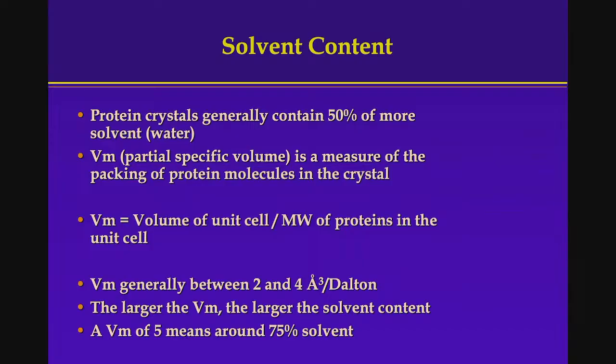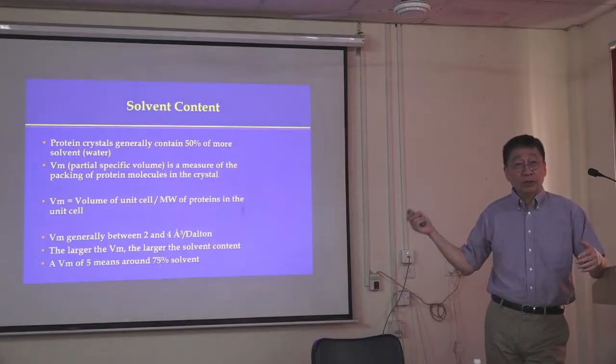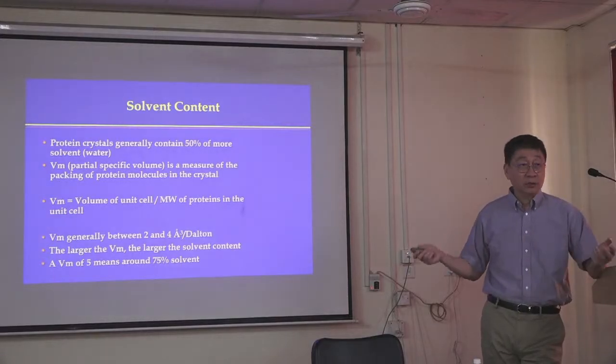So one of the standard criticisms of crystallography is that crystals are solids, and we are not solid. Well, you know what I mean. We have a lot of water in us as well. So biochemistry happens in aqueous solutions, right? So one of the standard criticisms is that protein crystals are solid, so they do not reflect what happens in us, because in us, proteins function in aqueous solutions.